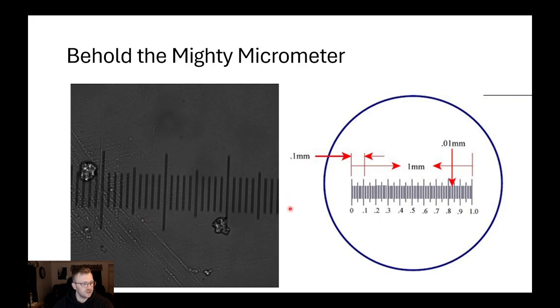This is the hard way. Like I said, the easy way is just trust what CellSense is telling you. The software will most likely do it for you. But if you don't have that capability, you can put a micrometer on your microscope using the objective that you're going to take your images of your sample on, take a picture, then do your imaging. Then when you go to do your image processing, measure this distance in pixels. We know that this is 10 microns. And so then we're going to know how many microns are in each pixel on the image that you're taking.